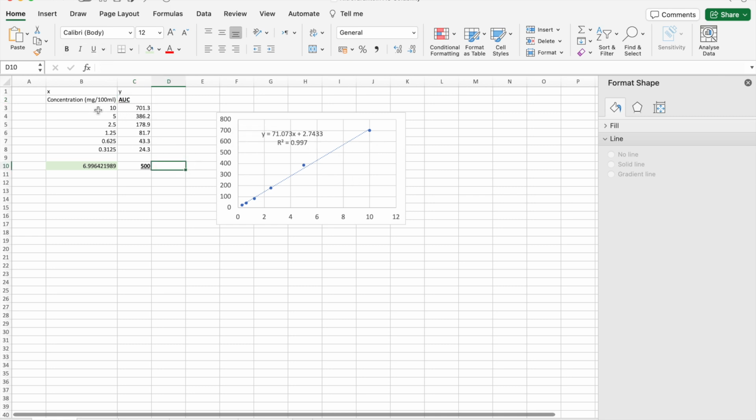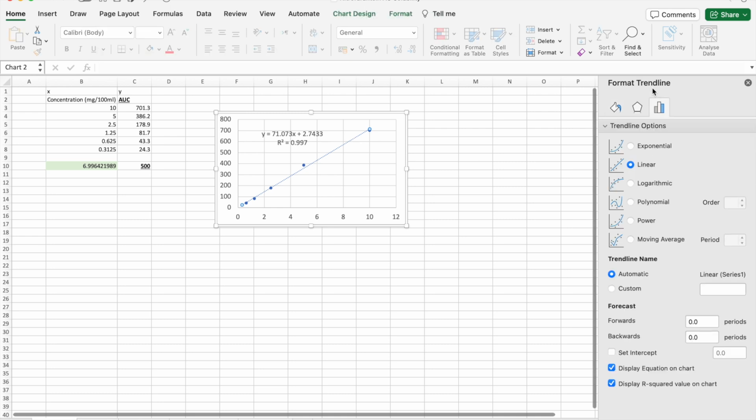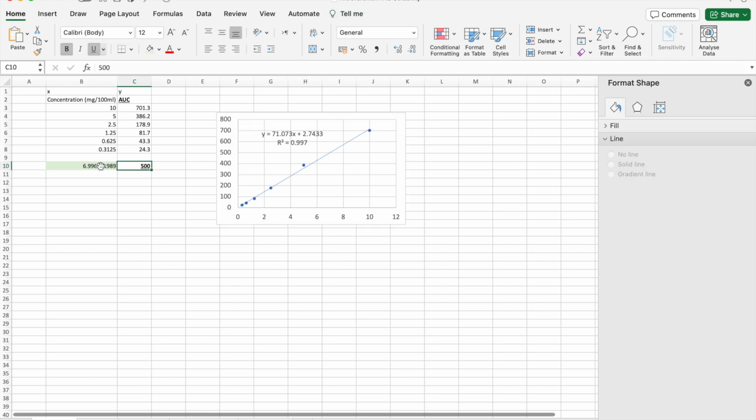And again, we construct the calibration curve by simply measuring the experimental value from a series of known concentrations, constructing a plot, inserting a linear trend line, and using our equation, translating any of our experimental values into a known concentration. Okay? So I hope that makes sense. A calibration curve allows us to transform experimental values into values that make sense, right?